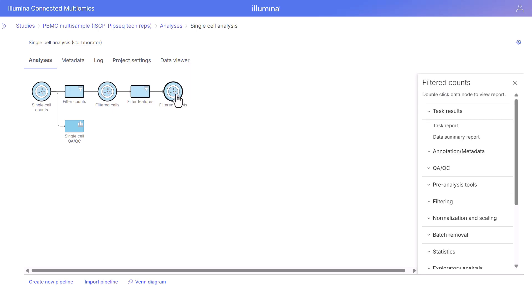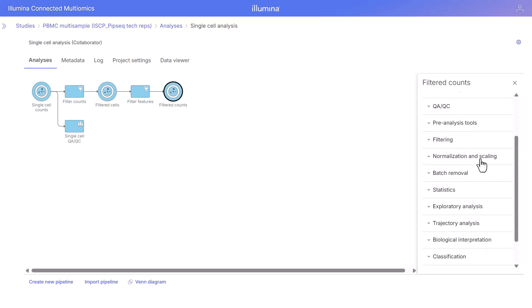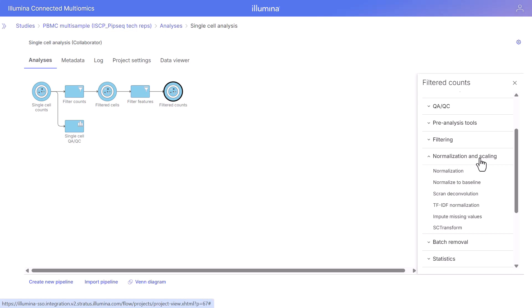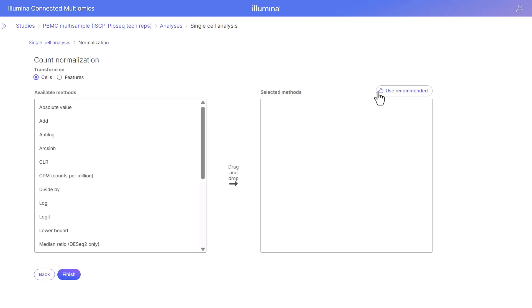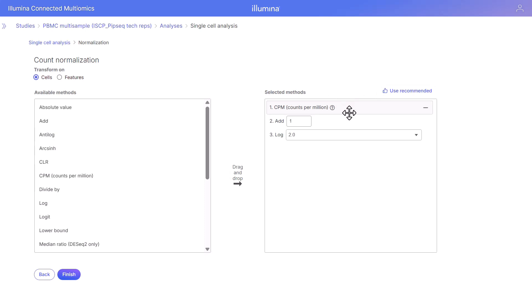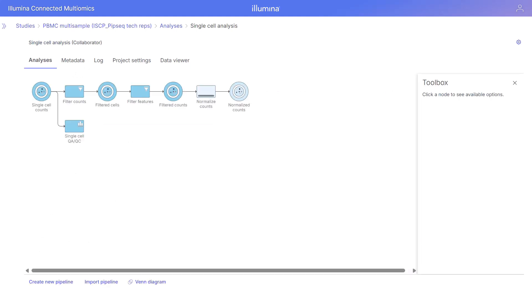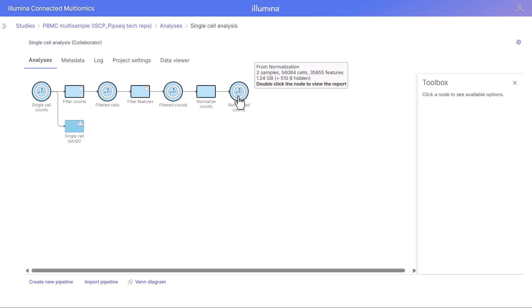Next we're going to account for variability between the cells by doing normalization. Navigate to the normalization section in the toolbox. Different normalization options are available. We're going to choose a normalization option and use the recommended button, which gives us the selected method for normalization. There are other normalization options you can choose. We're normalizing these cells — click finish.